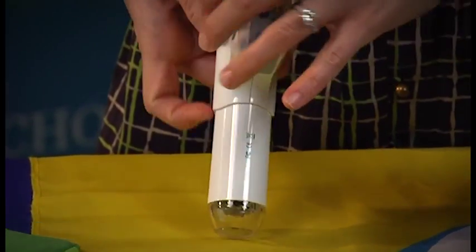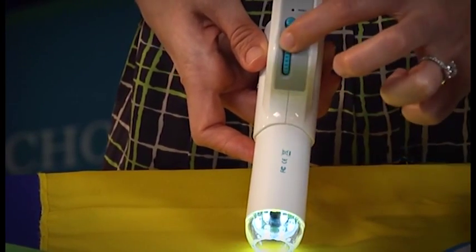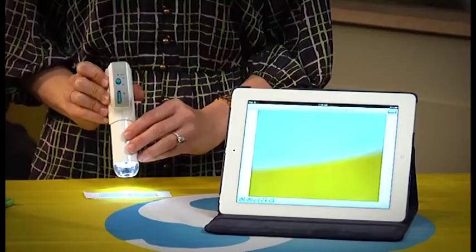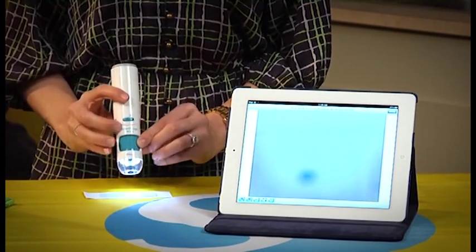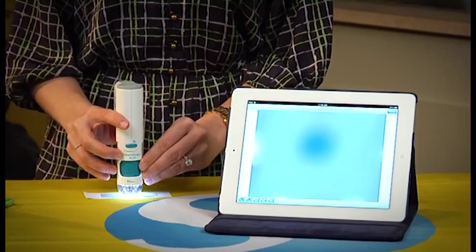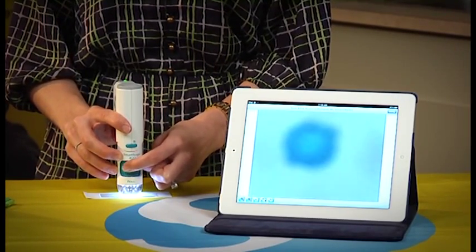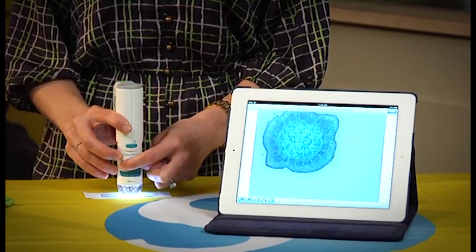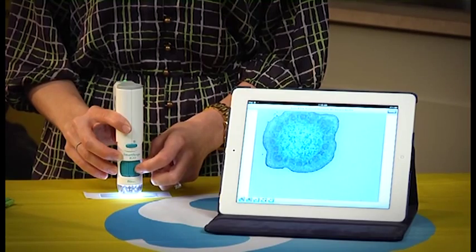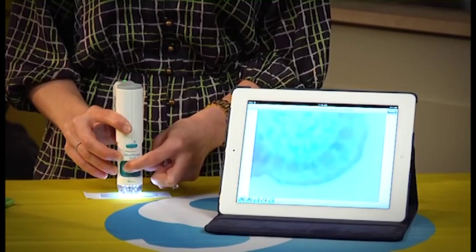If you flip it over to the back, you'll see a light dial that helps you control the light intensity, as well as your on/off switch. To view your sample, you'll start with the focus dial turned all the way to the right, then place the SmartScope iGo on top of your sample and slowly turn the dial to the left. You'll see the sample come into focus, and if you want to continue to magnify it, you can actually bring it into focus one more time at a higher magnification.